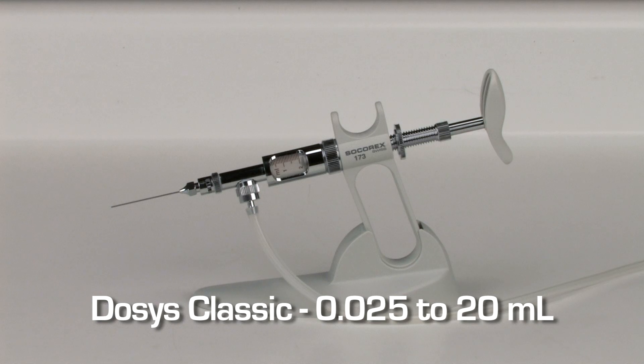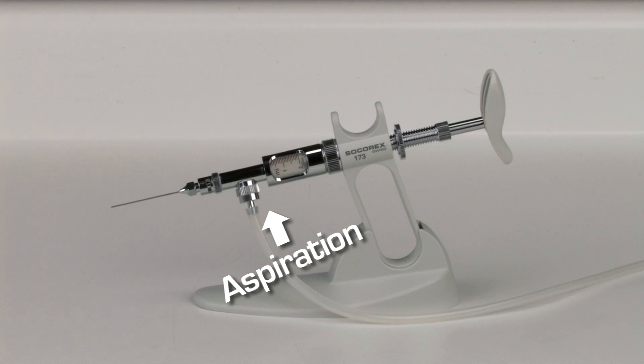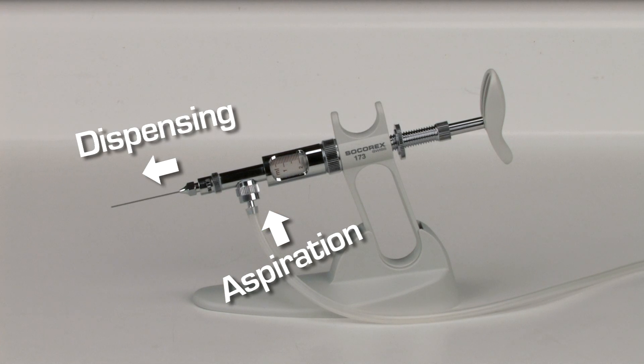The Dosys Classic is an automatic, self-refilling model with an integrated valve system. Aspiration occurs from the inlet valve and dispensing through the outlet valve.